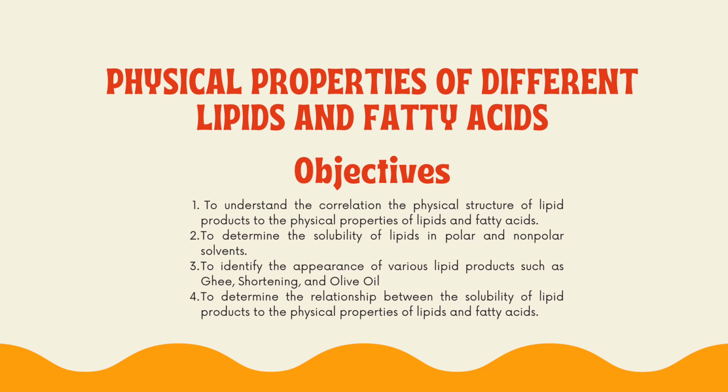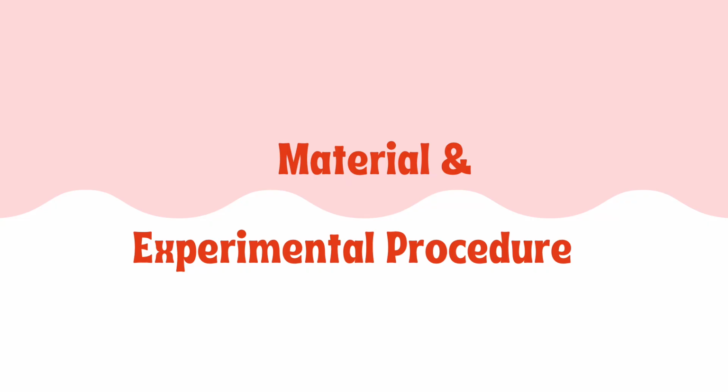The third one is to identify the appearance of various lipid products. The last one is to determine the relationship between the solubility of lipid products to the physical properties of lipids and fatty acids. Let's move on to the materials and experimental procedure.